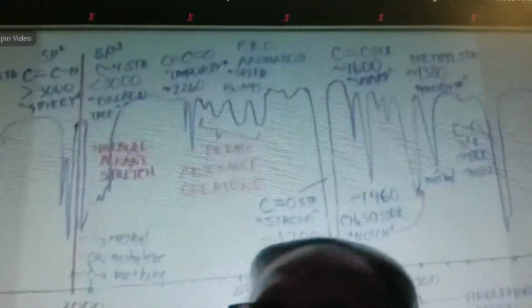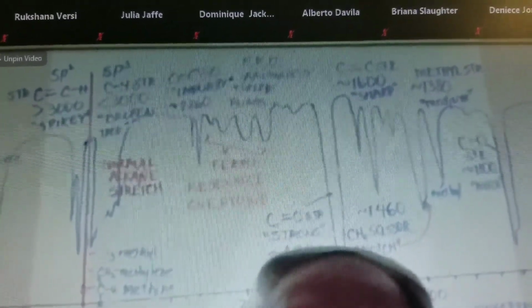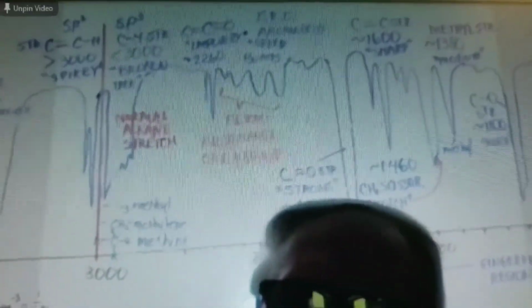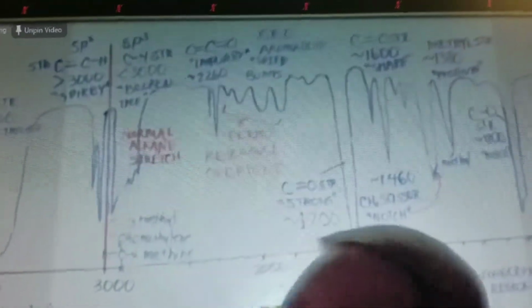Why? Because in your book, it's done by professional spectroscopists, and they purge or sparge the sample with nitrogen gas before they run an IR. This is to get rid of all of the CO2. Or they mildly heat the sample in reduced pressure. They'll reduce the air pressure above the sample and gently heat it, and all the CO2 will go out of it.